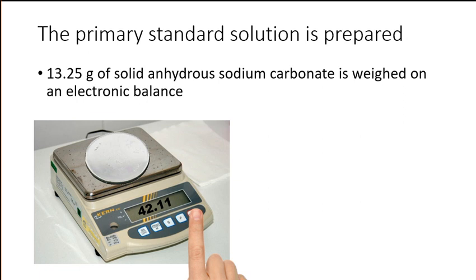And then I'll press the TARE button, and that'll set the balance back to 0. Then I'll place the powder on the dish or whatever container you're using. And in this case, I get a mass of 13.25 grams.